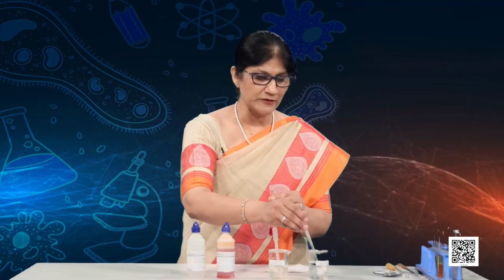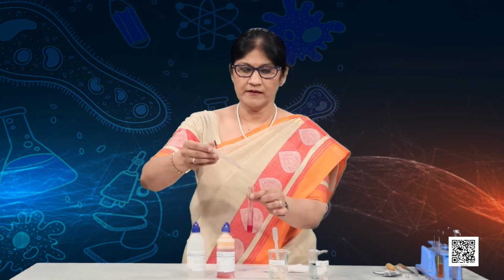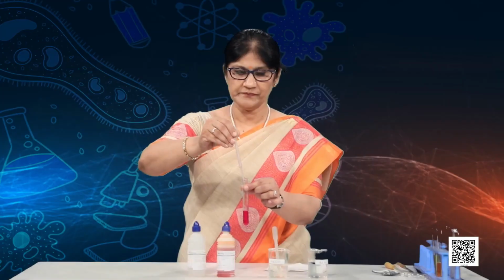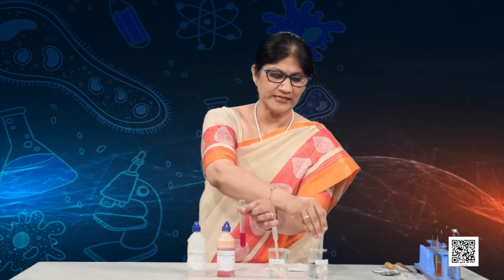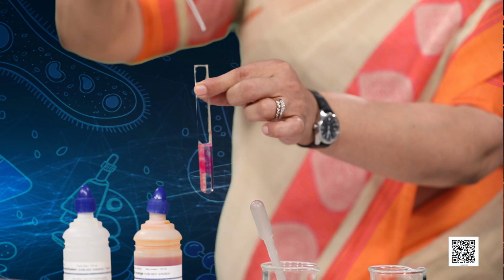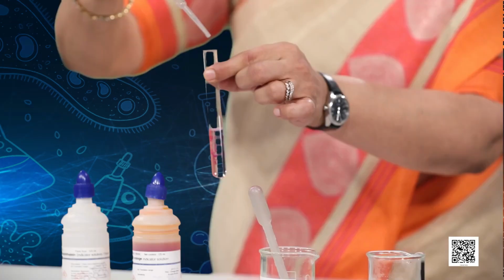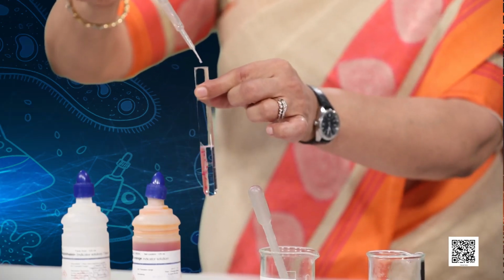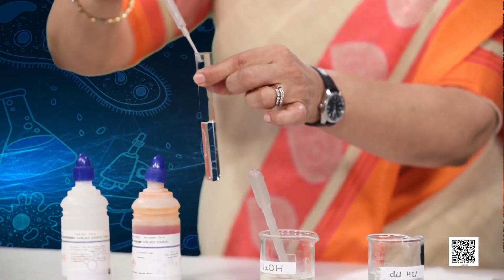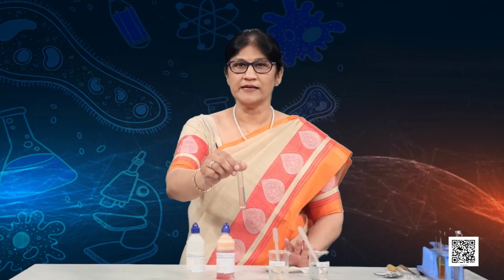Now if I add some acid to this, I have to see what happens. Do you see that the color is decreasing, diminishing? Wow! Slowly, as acid and base react with each other, that means they neutralize each other, the color disappears, because now the amount of acid in this test tube is more than the amount of base. So all the base has reacted with the acid and the color has disappeared.